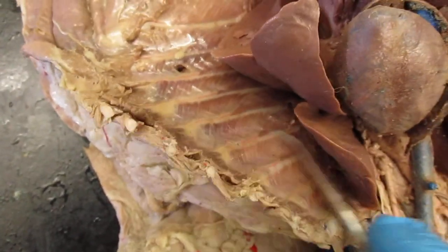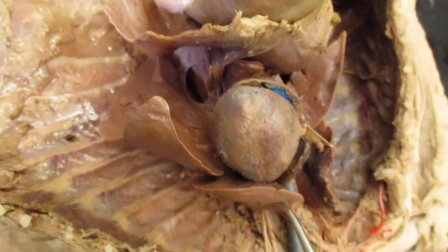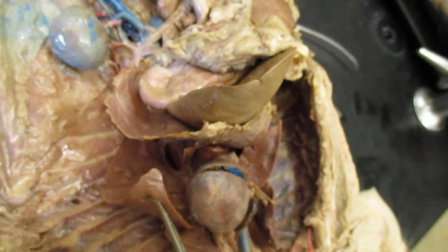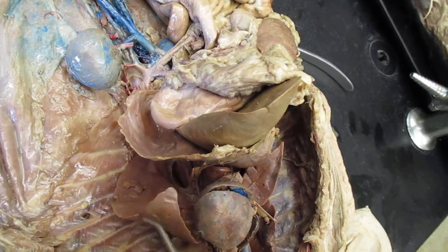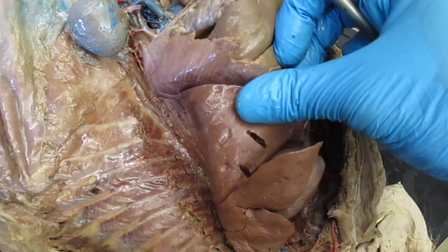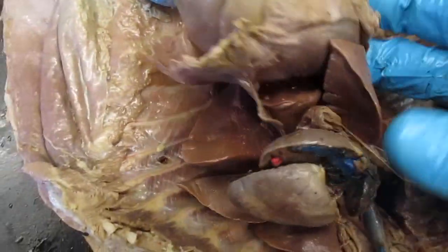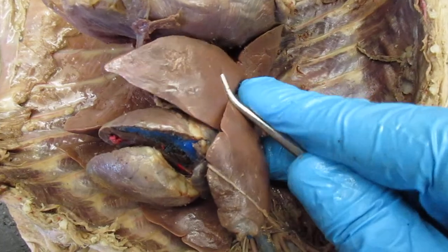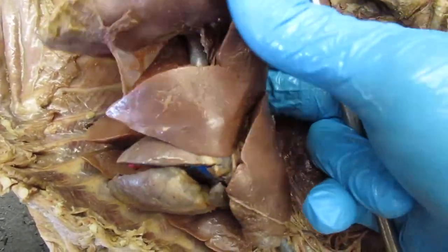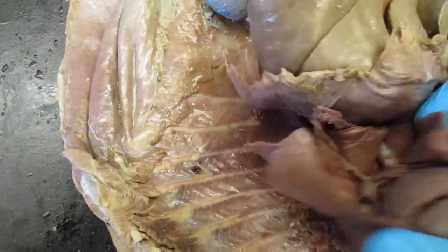Okay, now you have your intercostal muscles here, and then you have the apical lobe on the left side, and then you have your cardiac lobe on your left side, and then your diaphragmatic lobe right there. Diaphragm, intercostals. On the right side you have the same thing. So apical, cardiac, and the diaphragmatic. Okay, and let's see if there's anything else here.